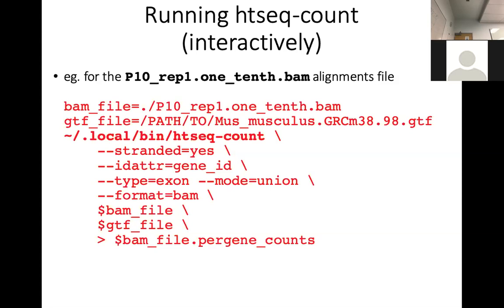Oh, so there should be a sample name before the trend. A sample, as in P10? So it's not $P10, it's $3. If you go back to the PDF, $3.